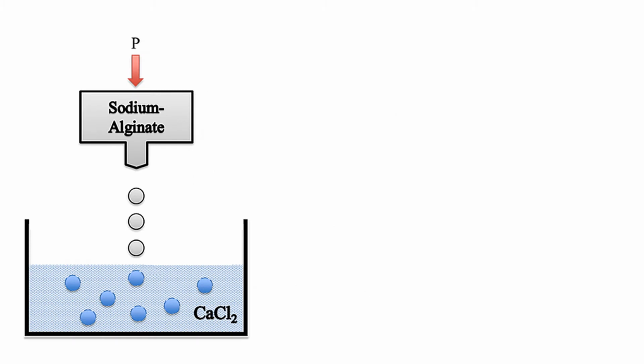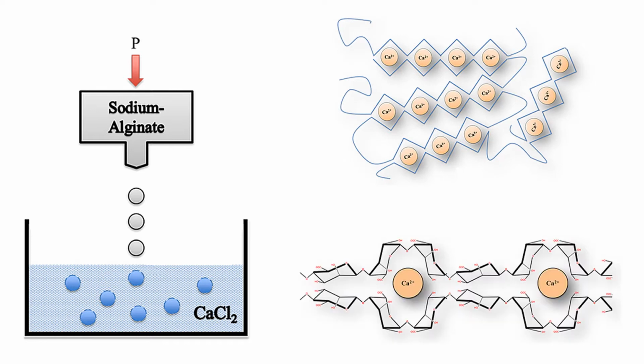In this experiment, the polymer alginate was used to cross-link the dye tartrazine, representing a drug. Alginate is commonly used as a cross-linking agent in pharmaceuticals due to its biocompatibility. Here, sodium alginate was exposed to calcium ions in the presence of tartrazine. The alginate folds around the calcium ions and the tartrazine is encapsulated within these folds.